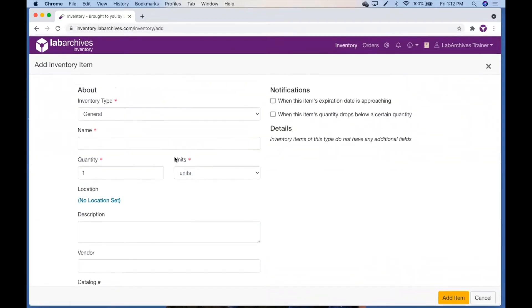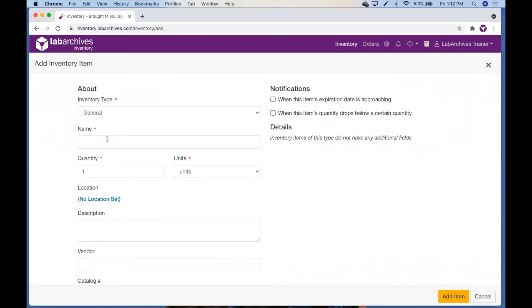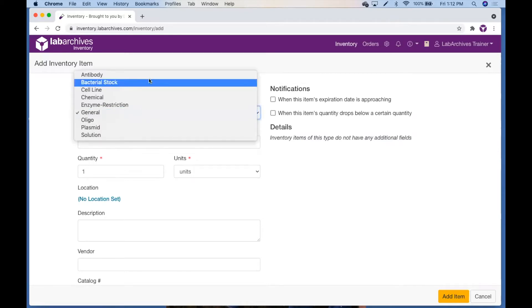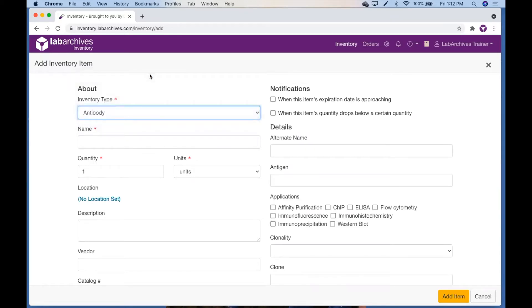You will also notice the fields with an asterisk are required fields. If you select a different inventory type such as antibody, you will notice the standard fields and non-standard fields that pertain just to the antibody type.